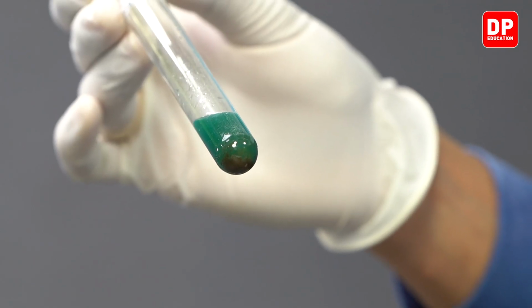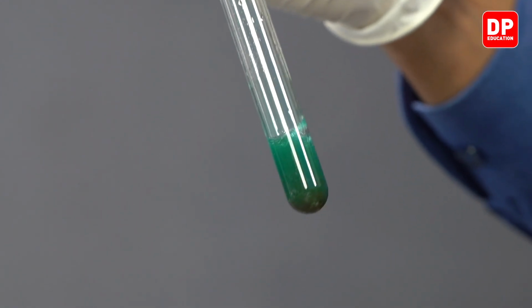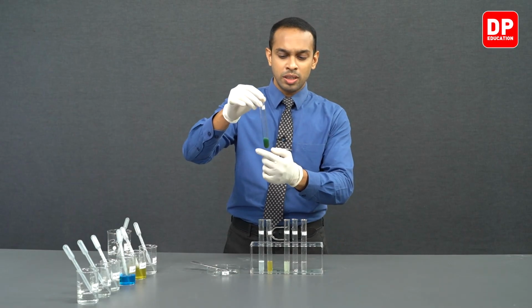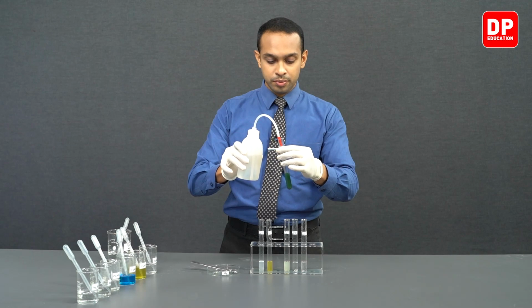This indicates that copper has gotten displaced as copper solid or copper metal. When you disperse the copper solid, we can observe the solid particles over here. If you want to very clearly observe that, we can dilute this a bit further.